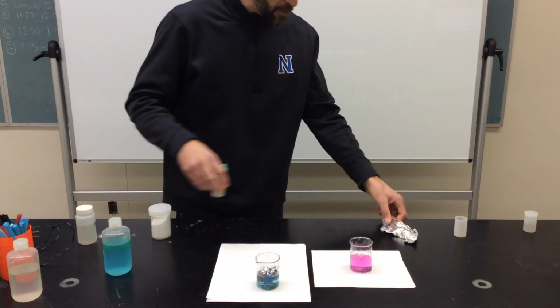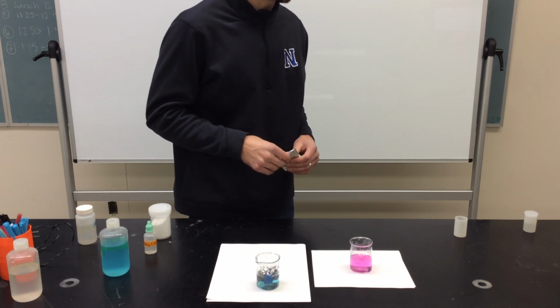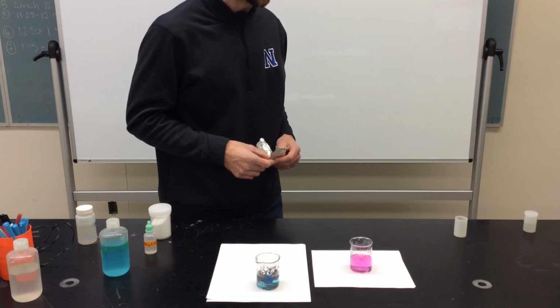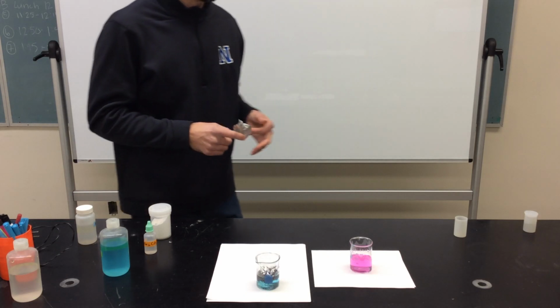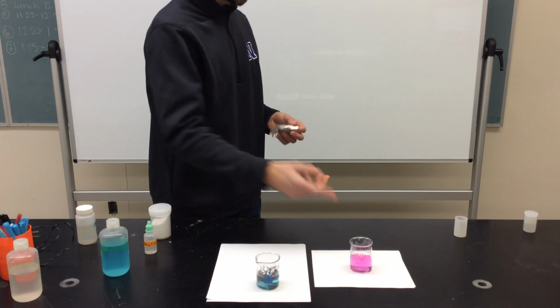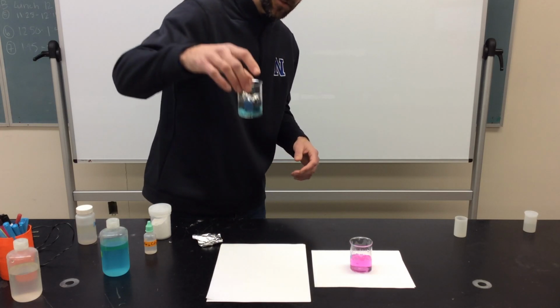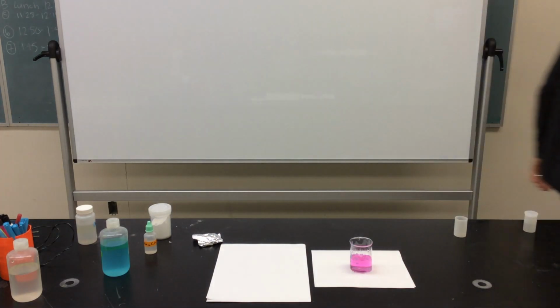Let's go back to what I think it was, Haley? Haley, did you say that we were going to see a reaction? How would you know that a reaction has happened? Because it's changed colors. Very good. One of the clues that a chemical reaction has occurred is that we get a change in color. So we see a color change right here, right? Another piece of evidence that a chemical reaction has occurred is that we see bubbles.